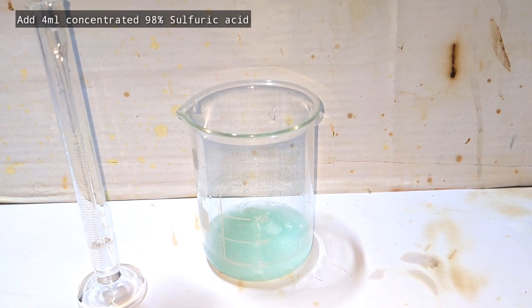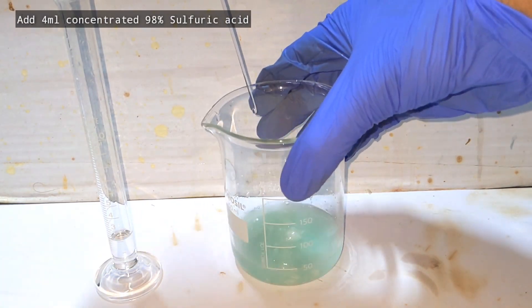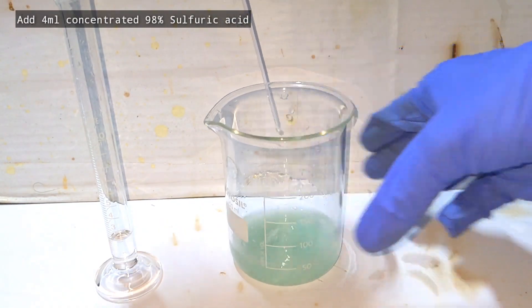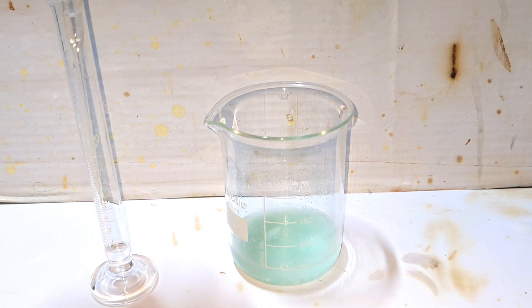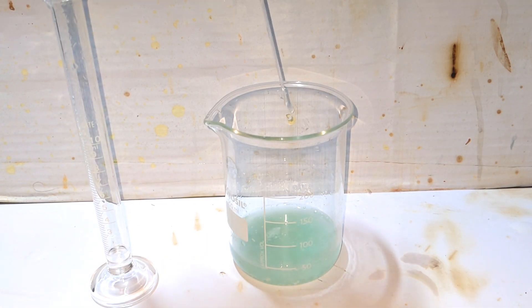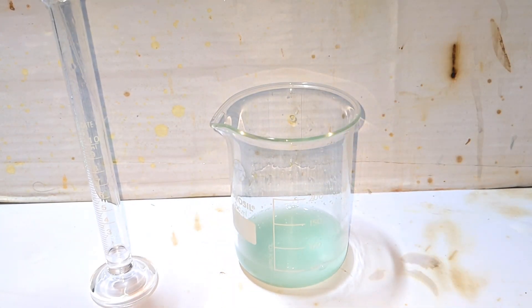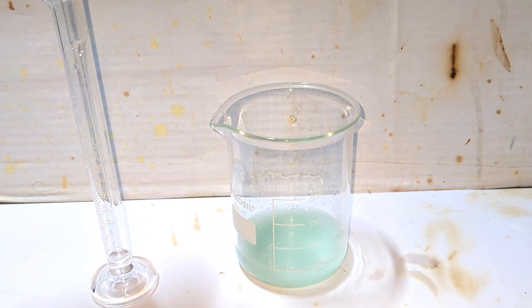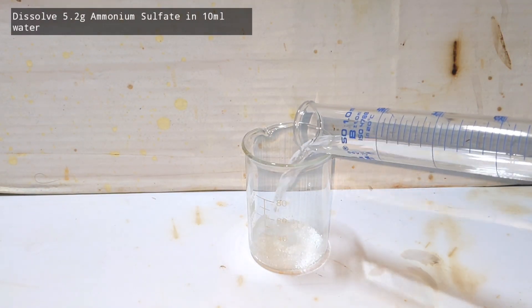Now I add 4 milliliters of concentrated 98% sulfuric acid. This prevents hydrolysis during dissolution and also helps the crystals dissolve better. I am adding the acid very slowly using a glass dropper, because the addition of concentrated sulfuric acid to water is extremely exothermic. Even though the amount is very low, I am taking standard precautions to avoid a splash.